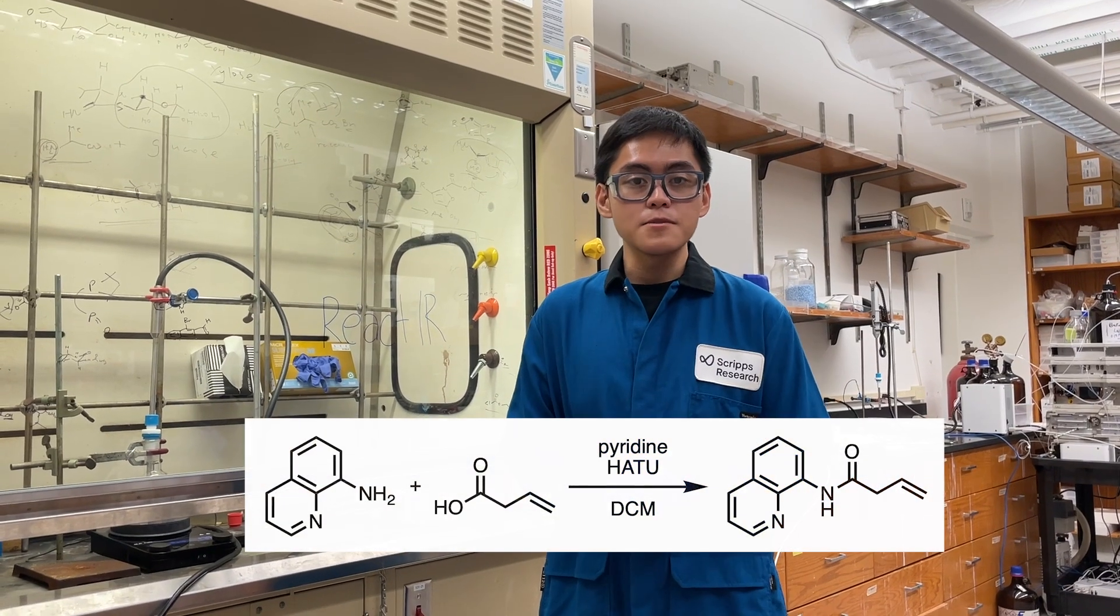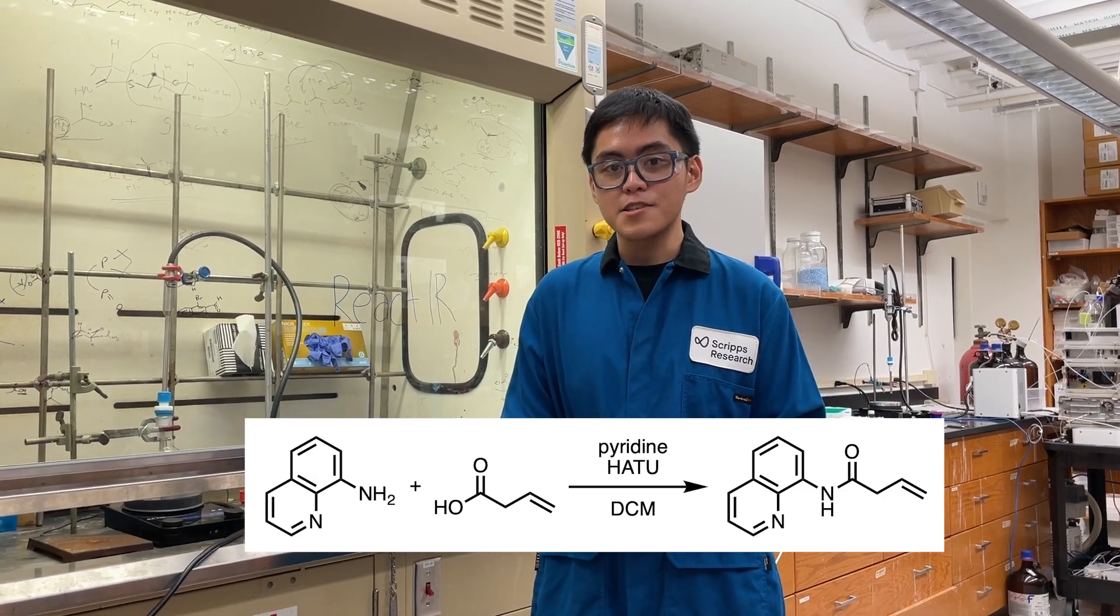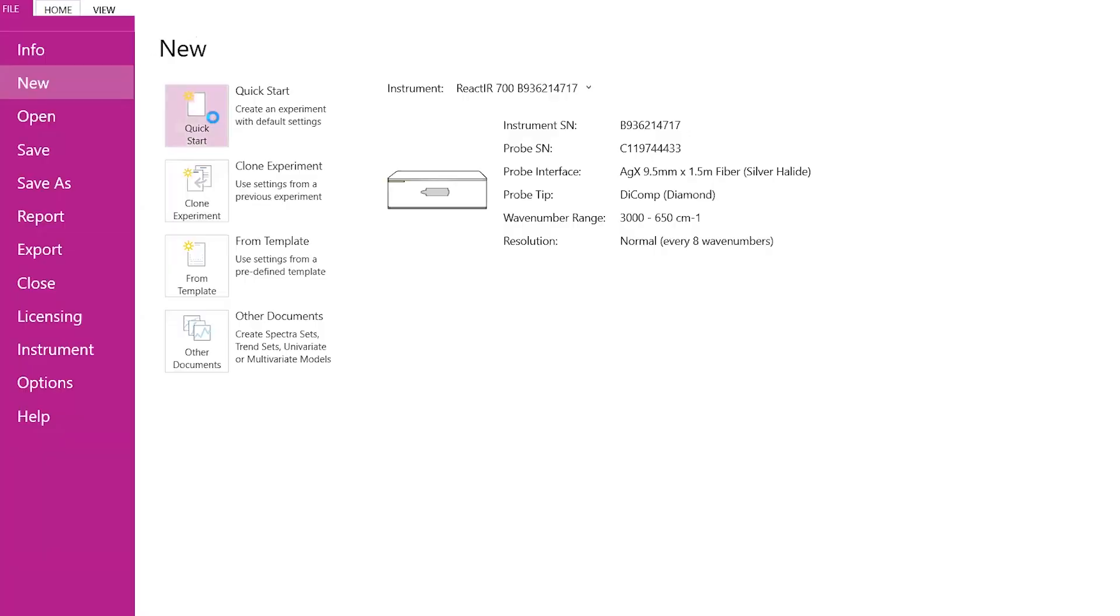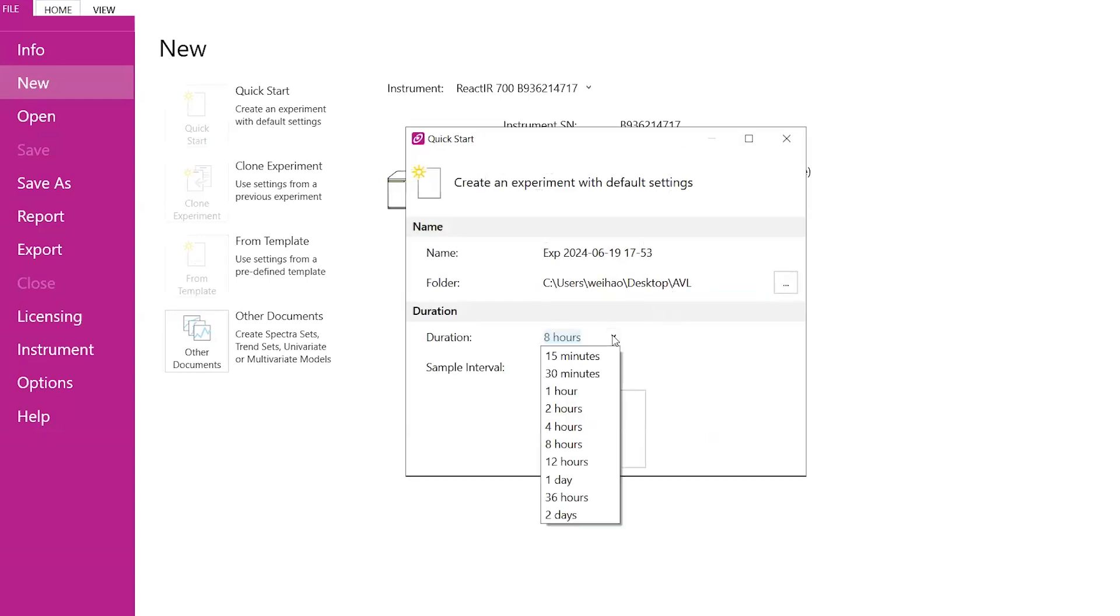Now let's do a demonstration of a simple amidation reaction. First, go to the software iCIR and start a new experiment. We'll just make the duration of this one day, since the reaction runs overnight, and then we'll sample it every five minutes.